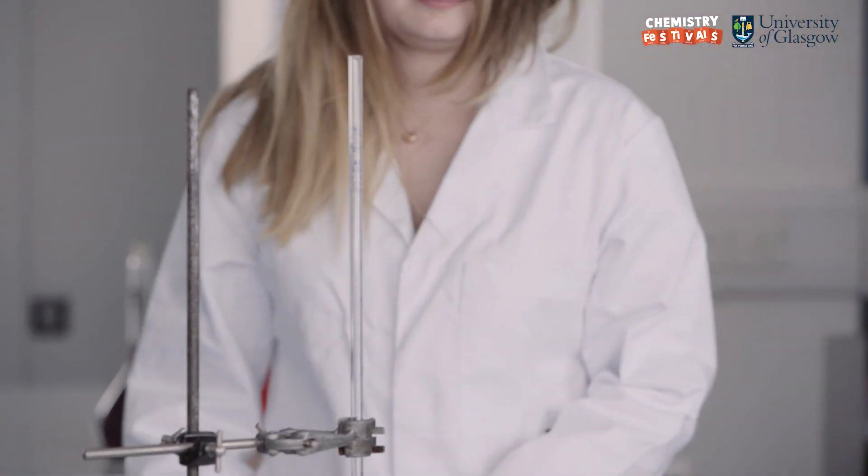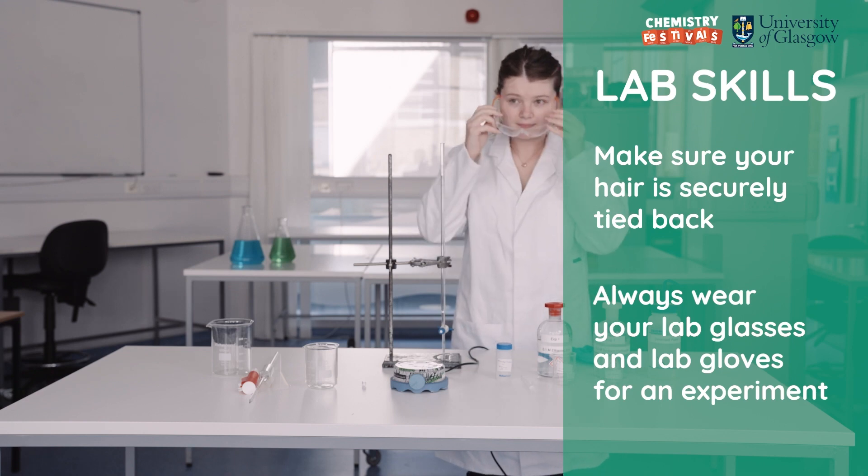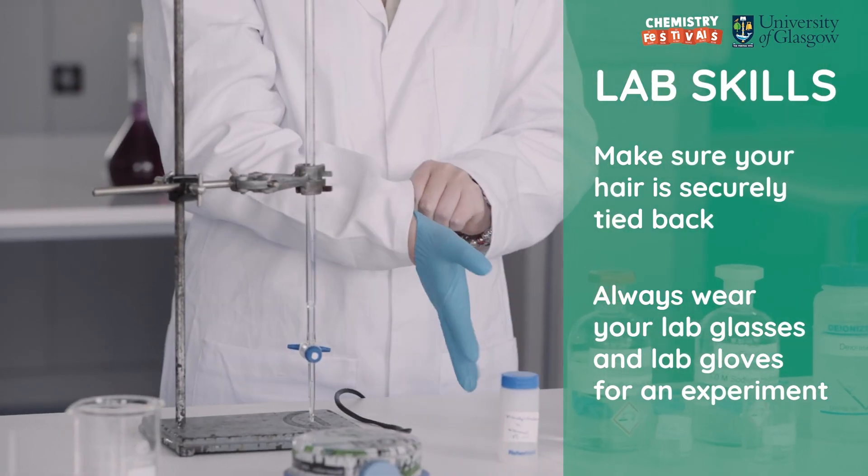Now I'm going to set up the burette. Before I start, I'm first going to tie my hair up, put my safety specs on, and put on my gloves, which is standard practice before any experiment.